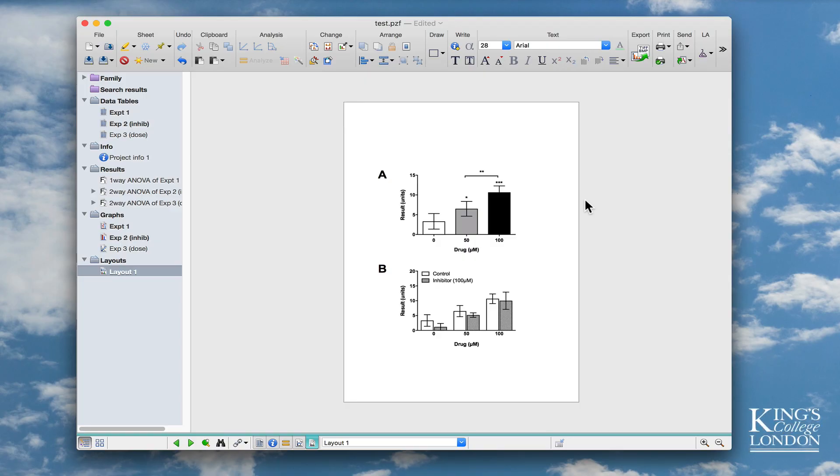Hi, so recently GraphPad introduced Prism version 8, which is another great leap forward in the functionality of their software. But one of the little things I just wanted to go through in this brief tutorial is just to compare the visual appearance of version 7 and version 8 when it comes to management of your information and data.